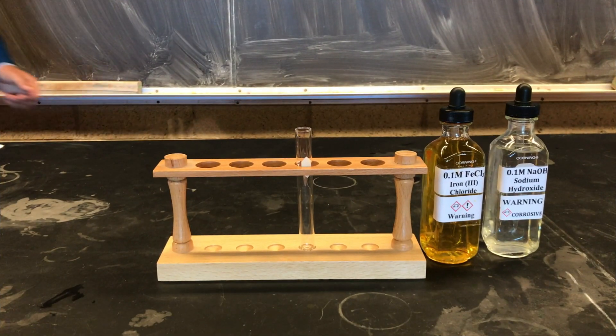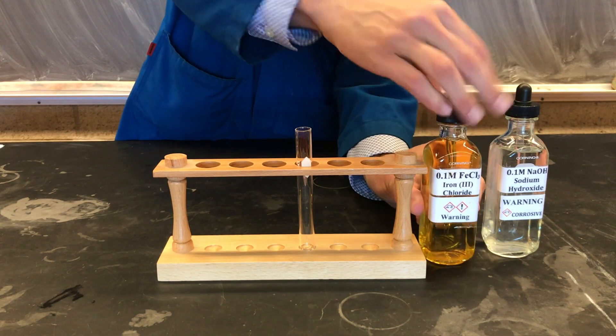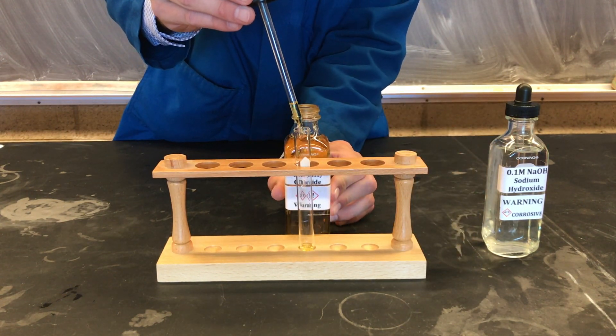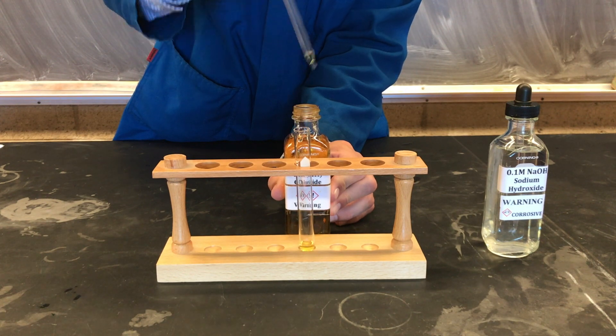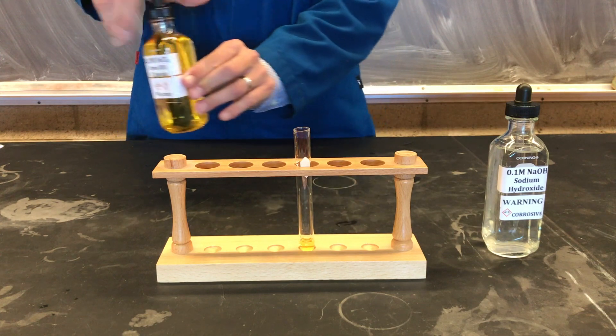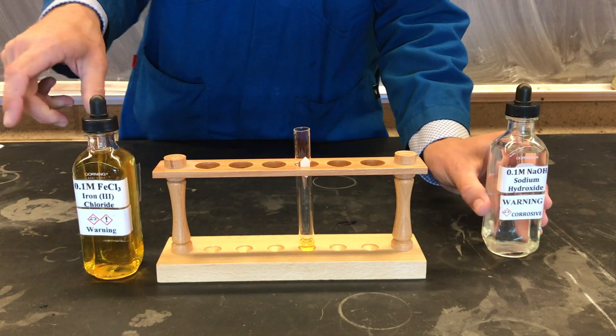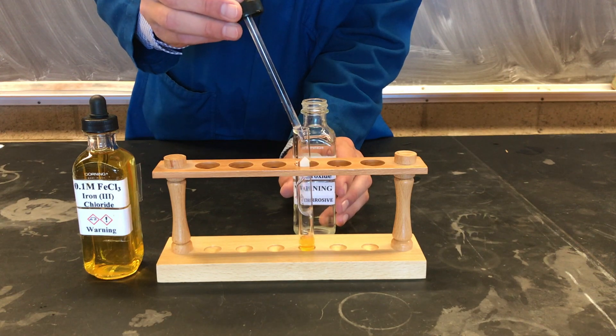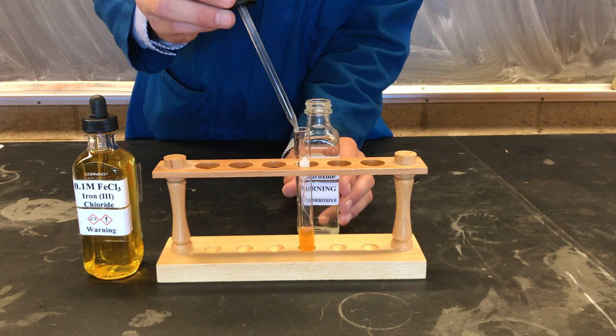In this reaction, we're going to be mixing 20 drops of aqueous iron chloride with 20 drops of aqueous sodium hydroxide solution.